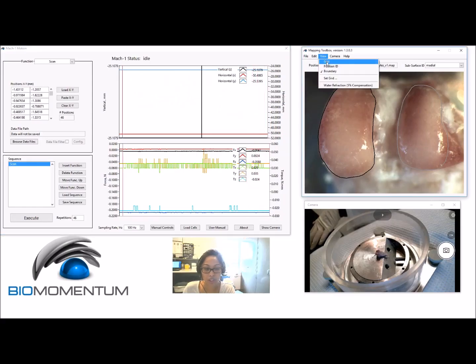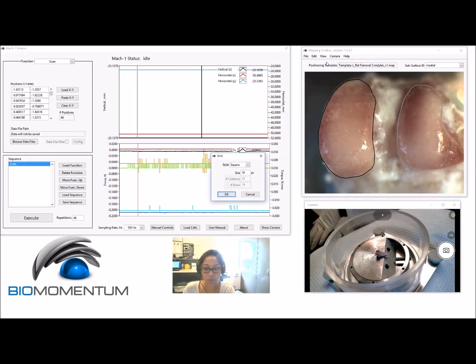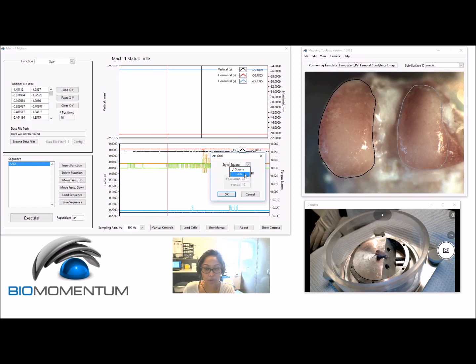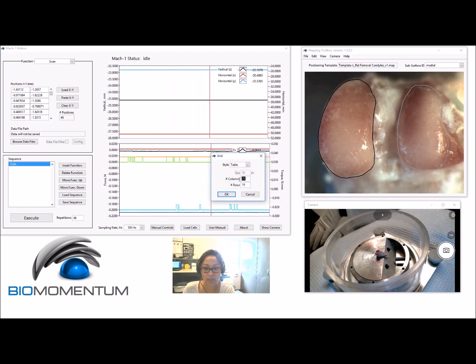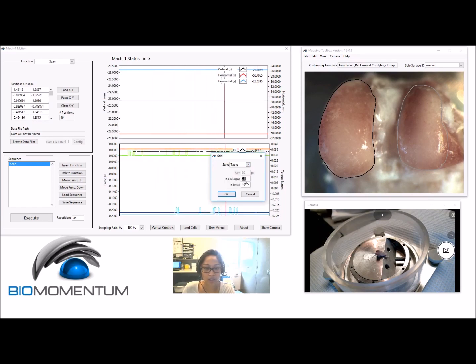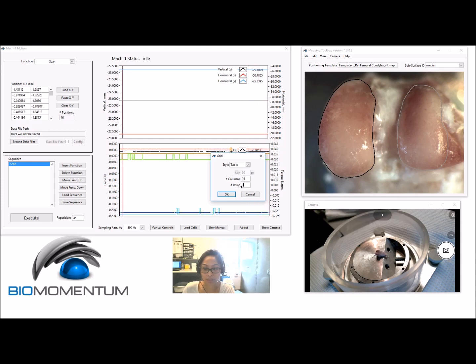To add positions, choose Grid in the View menu of the menu bar. You can select options for the snapping grid and it will be displayed in the camera feed.